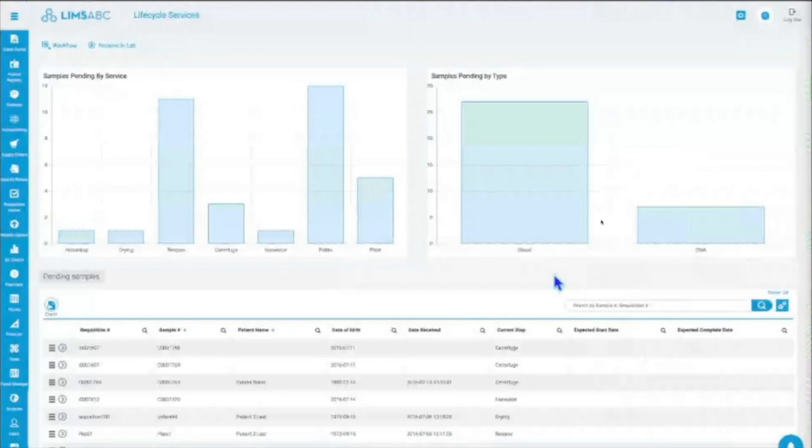Our inventory management is, I would say, more basic. It's meant for when we don't have a full system, and we can use it. It does some specific things related to the lab that help with tracking inventory at site. So I have my demo system open here. You guys should be able to see it.